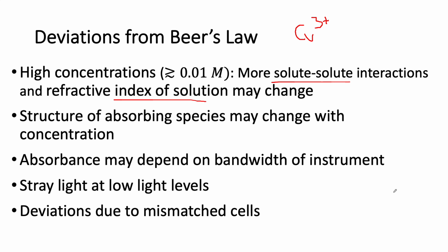All right, now you put your sample in there and it's very, very dilute. It looks just like pure water. Well, if you're getting almost the same as your original 100%, it's hard to measure the difference between 100% and 99.99%. It's just very difficult. And on the other end, if you're down below 1%, at 0.001%, that's difficult to measure for several reasons.